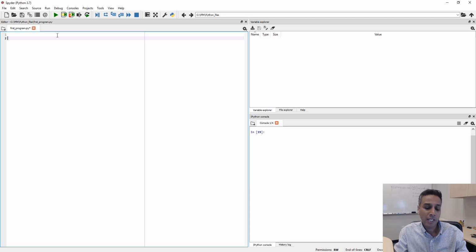Now, there is another format called OME-TIFF. And this stands for Open Microscopy Environment TIFF format, which is nothing but a TIFF file with an embedded XML that has all the information, all the metadata about that specific image. And go ahead and search for OME-TIFF online. And this is in fact by Bio-Formats.